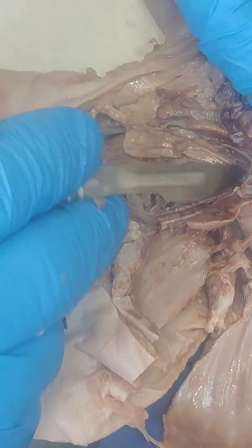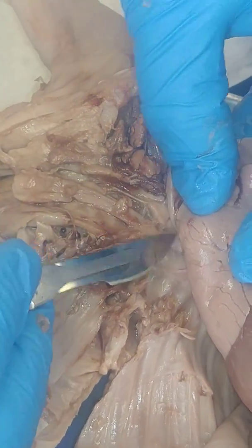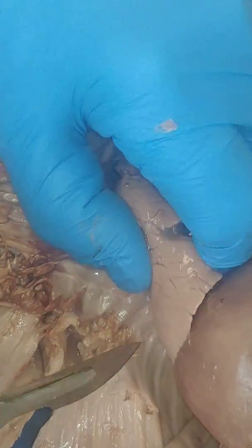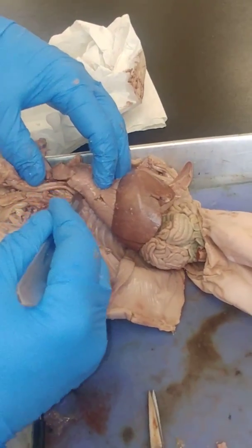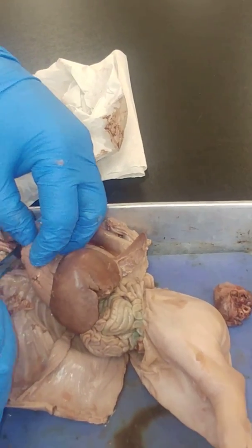So with this, then we're going to go down through here and we're going to try to remove the lungs. And leave the esophagus in there, hopefully, so you can see where it connects onto the stomach.